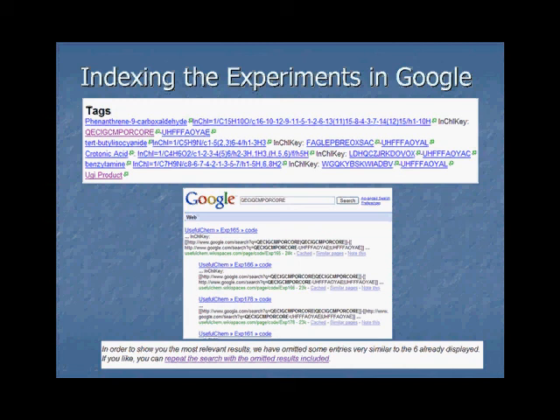And so what we've started to do in the past couple of months is use these InChI keys. And we used ChemSpider to provide the service to generate those InChI keys based on either the InChI or the SMILES that are submitted to it. And these links here of the common names, those are for human readability, and when you click on them, it takes you to ChemSpider. So that's how everything is connected together. So that when you do a Google search with this partial InChI key, it will come up with all of the different experiments where we use that compound.